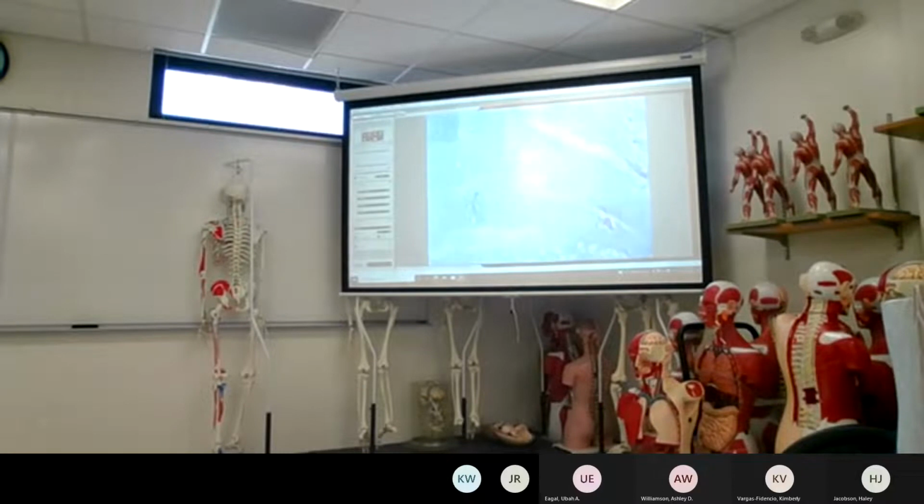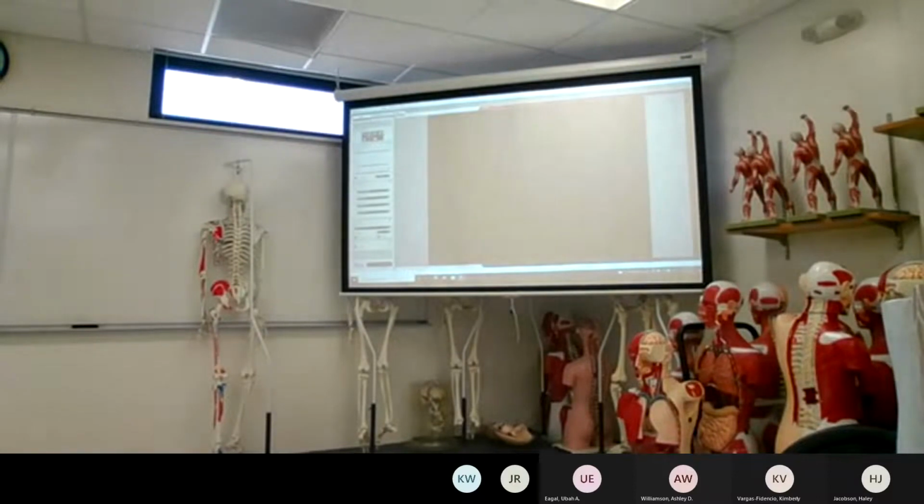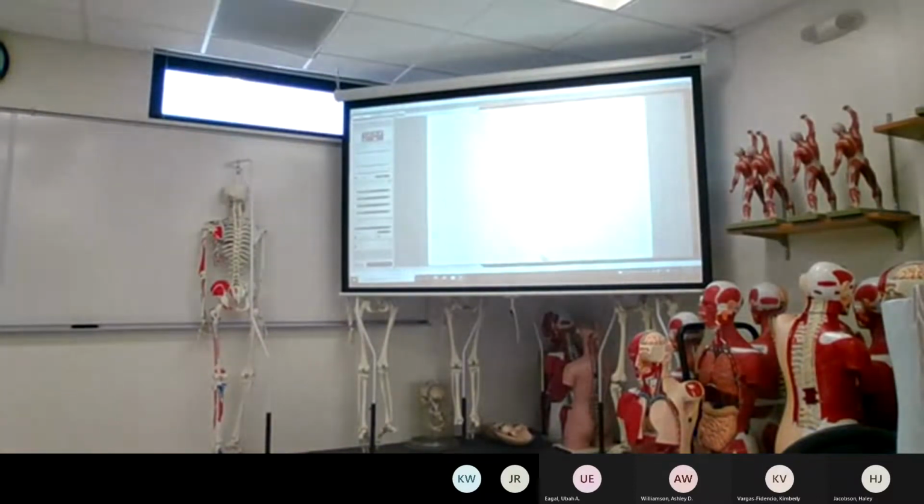So when you're looking at this, again, maybe I would try to find an area, maybe like here, where as you go into the higher power microscope, you would hopefully clearly see those lacunae, and that matrix is shredded a little bit.